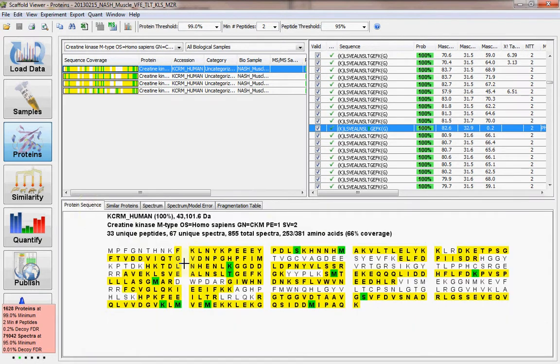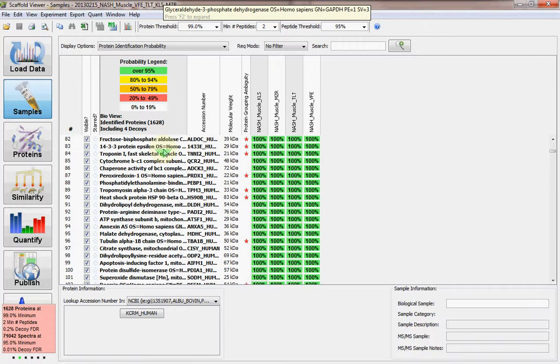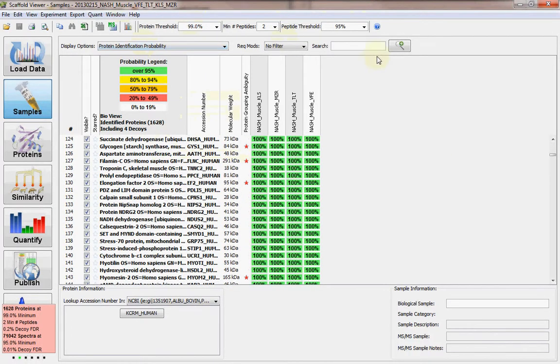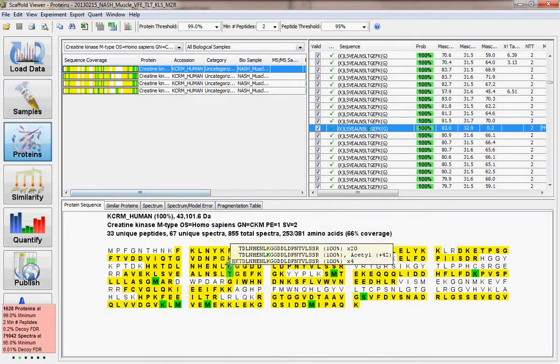And by piecing together these peptide sequences, we can figure out what proteins are present in the sample, and overall we can map out thousands of proteins in a given sample. And this is what typical software looks like in this particular field. The Scaffold viewer, for example, that we use in our lab, gives you this kind of display and allows you very easily to figure out where the modifications are within a given protein.